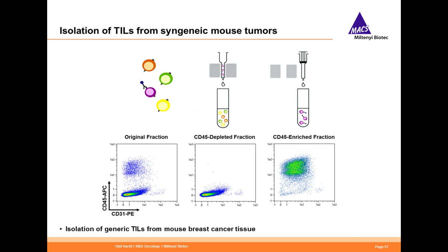So what we are using is antibodies that are specific for CD45 and coupled to magnetic beads to really allow for a pan white blood cell isolation straight from tumor tissue. And these reagents are now really optimized towards working with dissociated tumor samples, because I mean there have been CD45 selection reagents available for years or even decades.